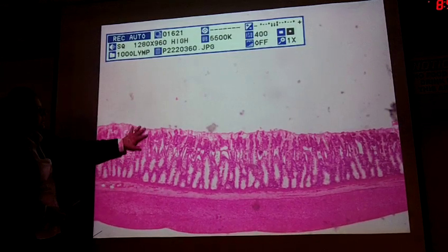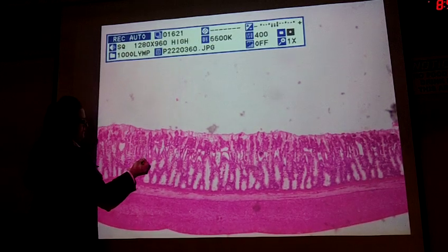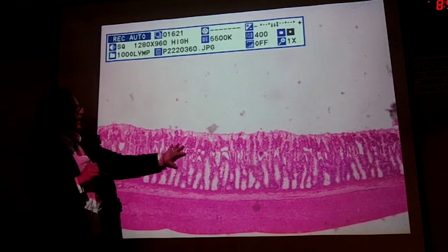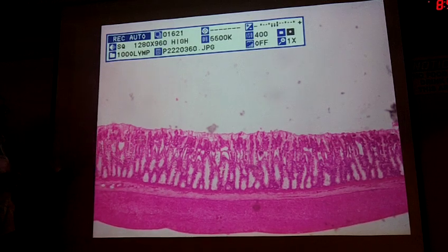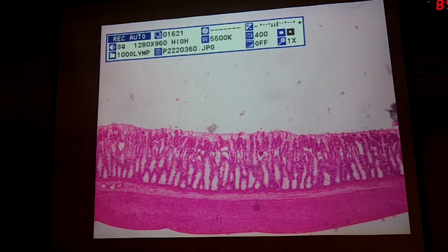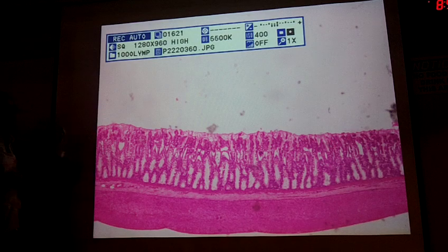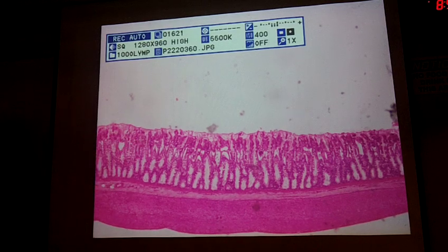Now, when you look in here in the mucosal tunic, all these little spaces that you see, they almost look like clear circles. Those are your goblet cells filled with mucus. And if you think about the colon, it makes sense that you're going to secrete a lot of mucus because you are absorbing the last little bit of water here in the colon, and you're producing the feces, and you need to move that feces. So it makes sense that you're going to produce a lot of mucus to help move the feces in a forward direction. So if we just magnify this here.